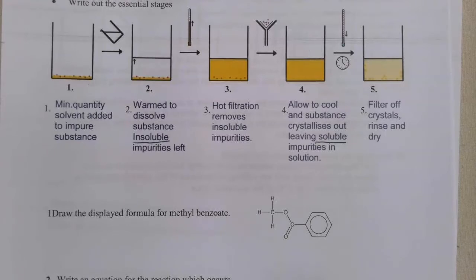The solvent choice is also important. We choose a solvent such that our crystals are soluble in hot solvent but insoluble in cold solvent. So the choice of solvent is very important in this case.